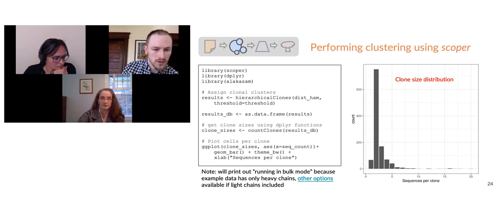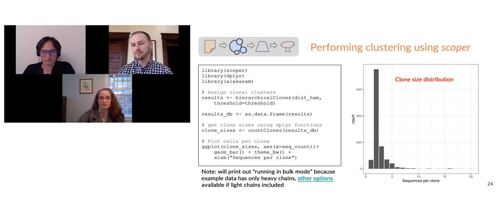Is the threshold always automatically picked? Not always. Sometimes you can have a distance-to-nearest distribution that looks bimodal enough, but the automatic threshold detection doesn't actually work. And sometimes you can just pick the local minimum manually. We also have methods for what's called spectral clustering, which don't require a fixed threshold, and that is also detailed on the Scoper site.